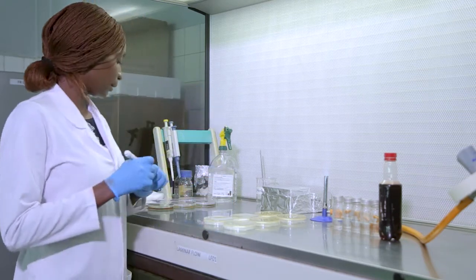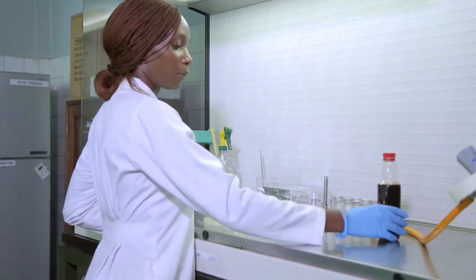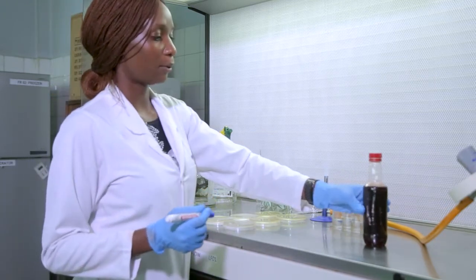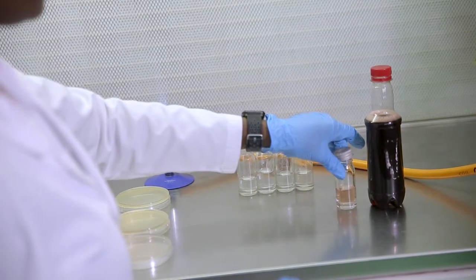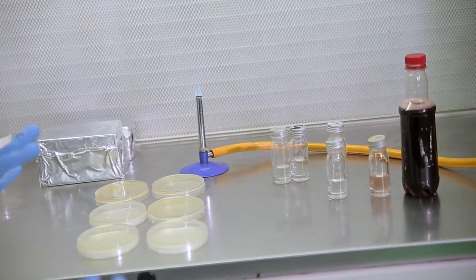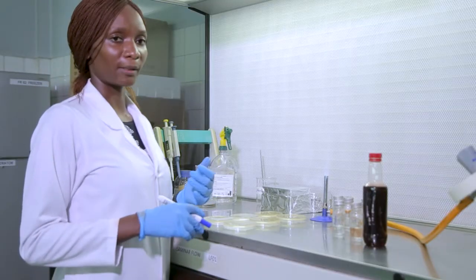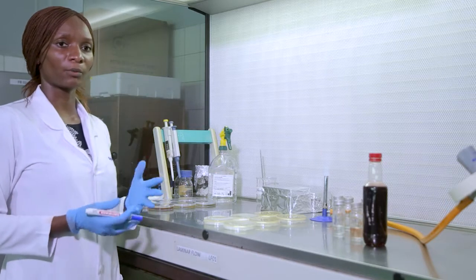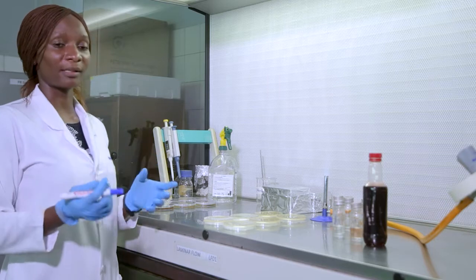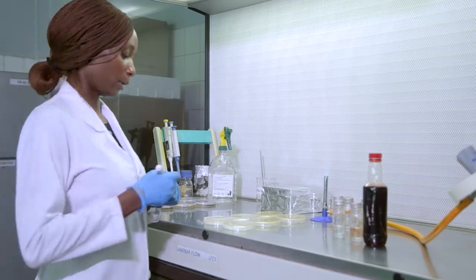So like we did in the previous technique, we have to label our petri dishes. Although before we do that, we're going to choose 3 dilutions to work with. In this case, I'm going to go with the sample itself. I'll use the -1, and I'll also use the -3. Like I mentioned before, the choice of dilutions depends on the history of the sample. It depends on your experience, having worked with a certain group of samples. So you can easily know, or I could say guess, the samples that will give you plates with countable colonies.